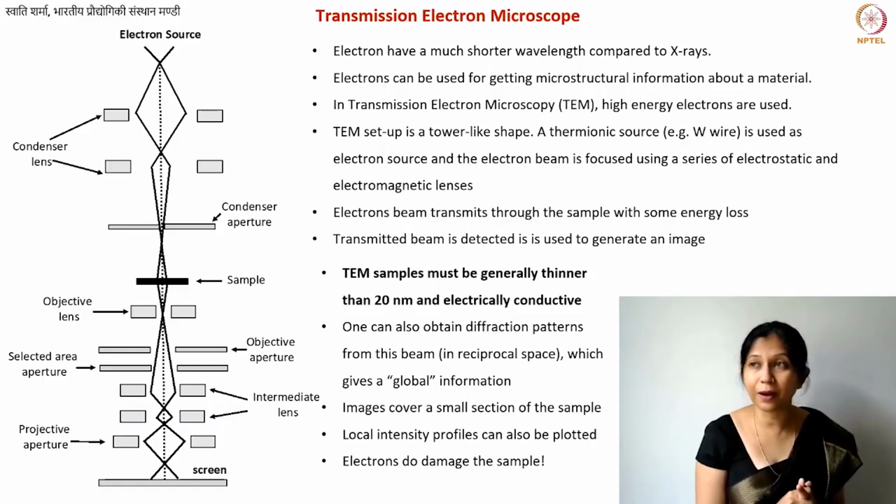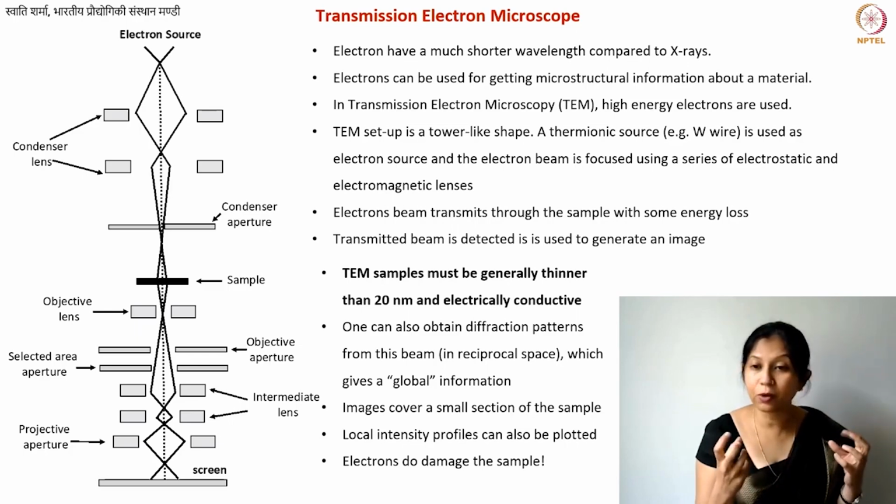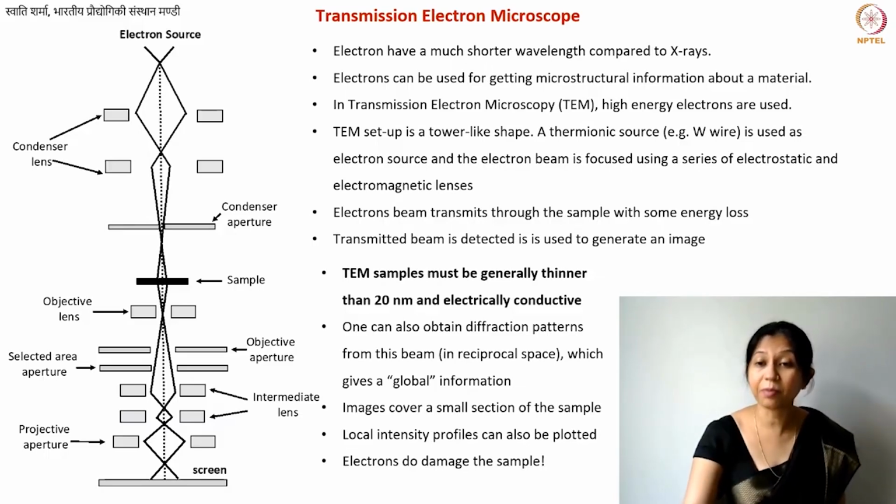But you should understand that if you're working with, for example, single or few layer graphene sheets, in that case, you may end up losing some information because of this sputtering. Graphene happens to be electrically conductive anyway, so it's not a problem. But I'm talking about the defect-containing or impurity-containing, graphene-like sheets. Because these kinds of sheets will also exist in the material that is at 800 degrees, but they are definitely not pure carbon. So you need to be careful. Your samples are sensitive to electron beams, and the electron beam can potentially cause damage to the surface of your sample, but well, it's pretty thin already.